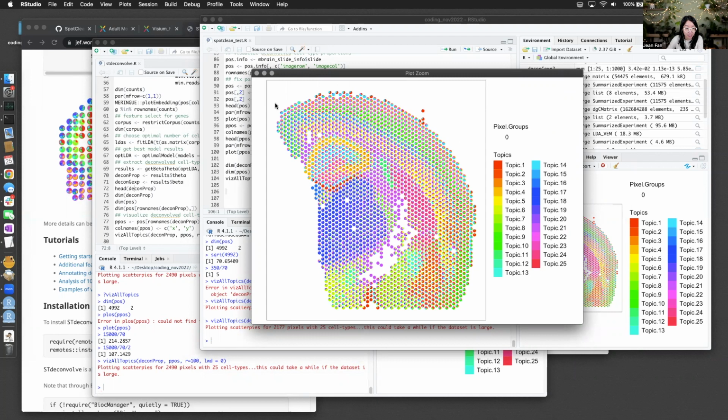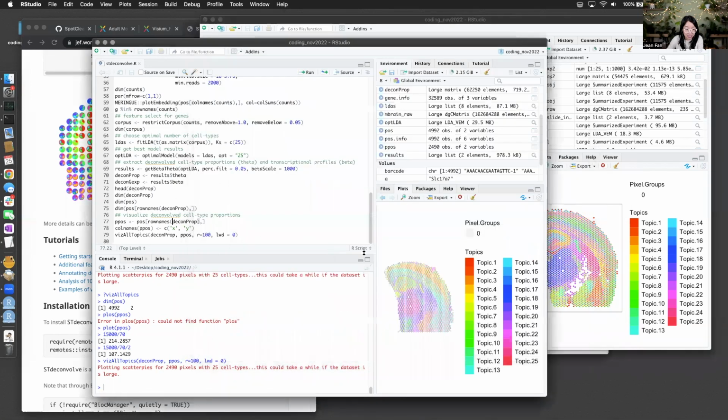And let's compare that with... very similar results, it seems. Also still layer structures. The colors don't necessarily match, so it's a little hard to see. Let's see, how do I go about comparing these results? I guess they're in different RStudio sessions.